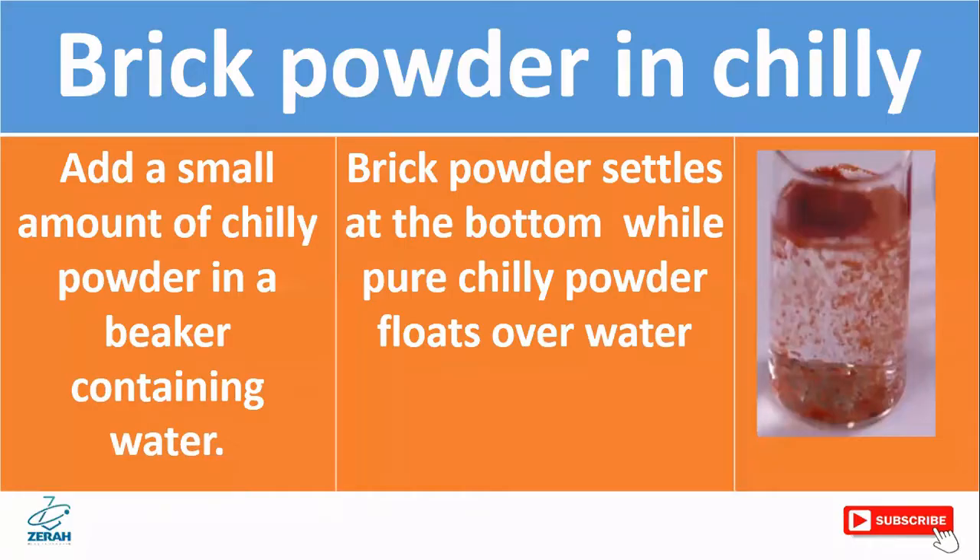First, test for brick powder in chili. Add a small amount of chili powder to a beaker containing water. The brick powder will settle down at the bottom, while pure chili powder floats over the water.